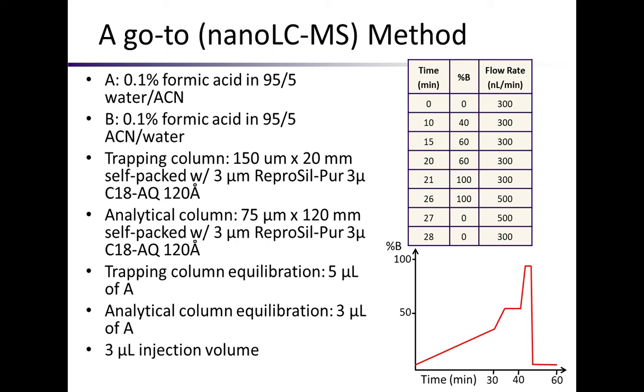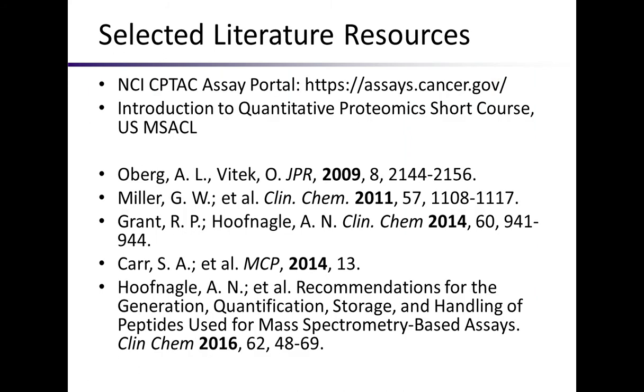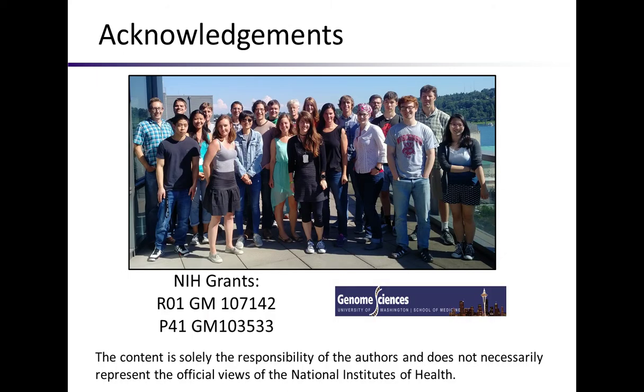Some go-to nanoLC methods for proteomics experiments are here with all of our parameters and the type of packing material and everything we use, as well as some selected resources for further reading on this sort of thing, everything from quantitative proteomics to just clinical chemistry and doing proteomics from there.